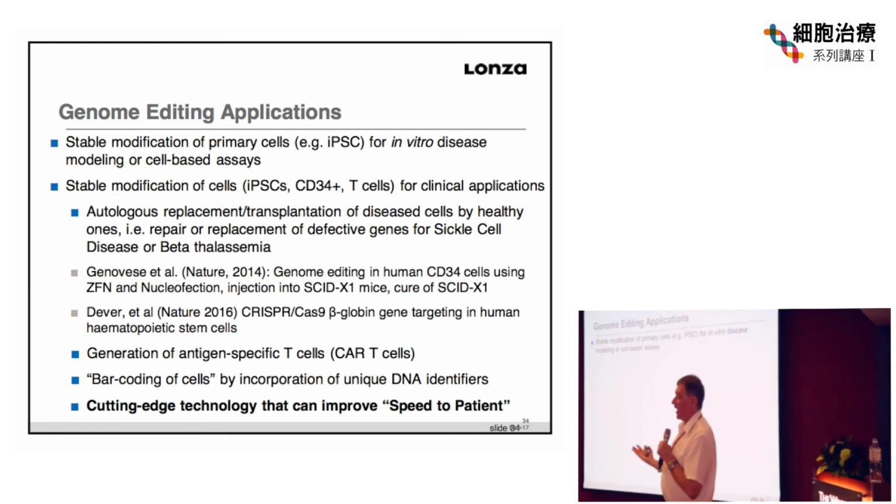And we have some customers up in Canada who are differentiating their iPSCs into lung epithelial cells, and then putting these into an air-liquid interface and then watching the further maturation of these cells. So everyone's getting very sophisticated in how they differentiate iPSCs. So then you put this in context with nucleofection and CRISPR. We can modify these iPSCs, and again, isogenic populations, identical except for that CRISPR modification, differentiate these down terminally, and now we have human cells in a dish, identical except for that CRISPR modification, and now we can begin to do science with normal cells.